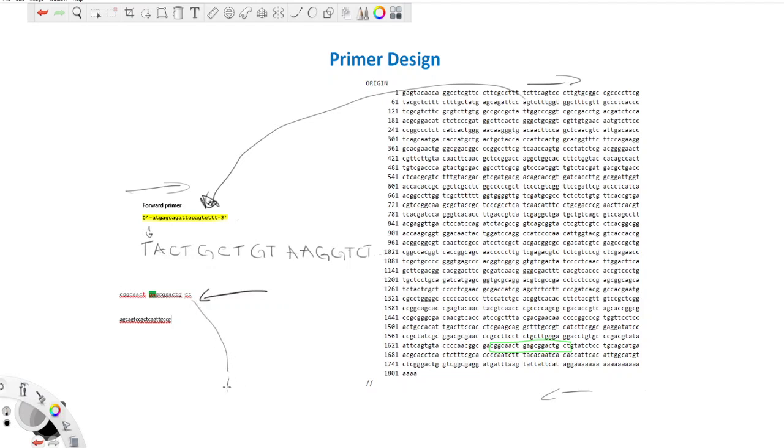This is now A, this is G, this is C, and this is G. Again, this is T, and this is what you got here: A, G, C, A, G, C. Yeah, I forgot an A somewhere in the middle here, but hopefully you get the picture.